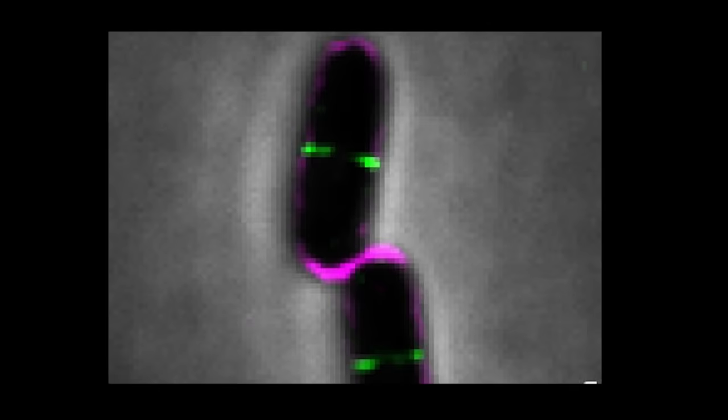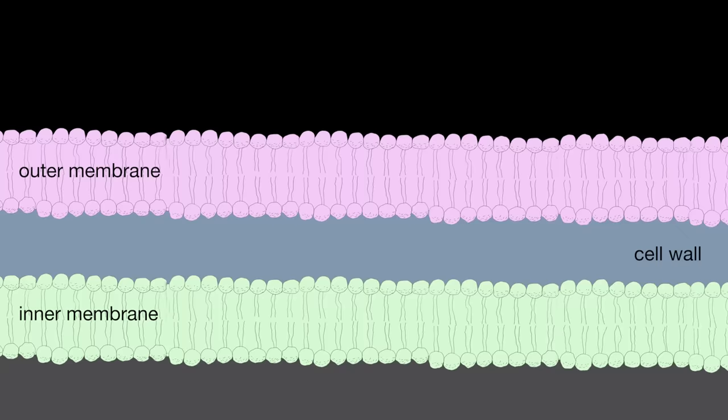Researchers at Harvard Medical School have captured extreme close-ups of bacterial membranes and their cell wall exoskeleton during cell division, providing never-before-seen views of the processes involved that may provide new clues for fighting antibiotic resistance. The work focused on the double-layered membranes of E. coli. Some of the most dangerous bacteria that infect humans have the same double membrane structure, which makes it hard to get drugs into the bacteria and kill them.